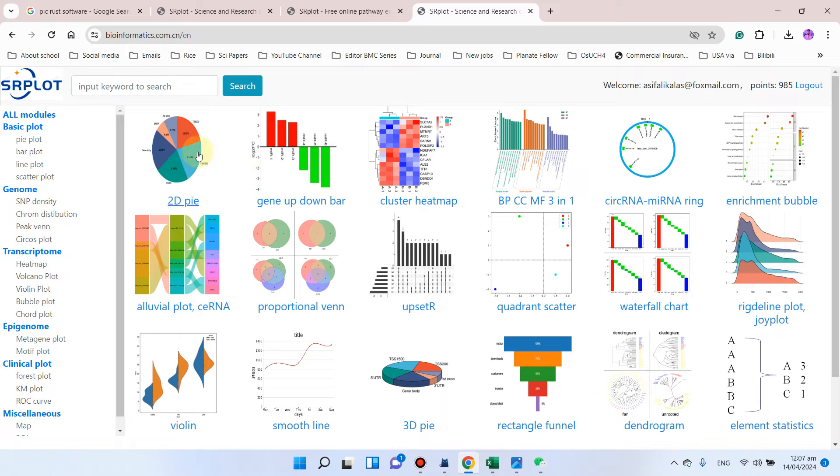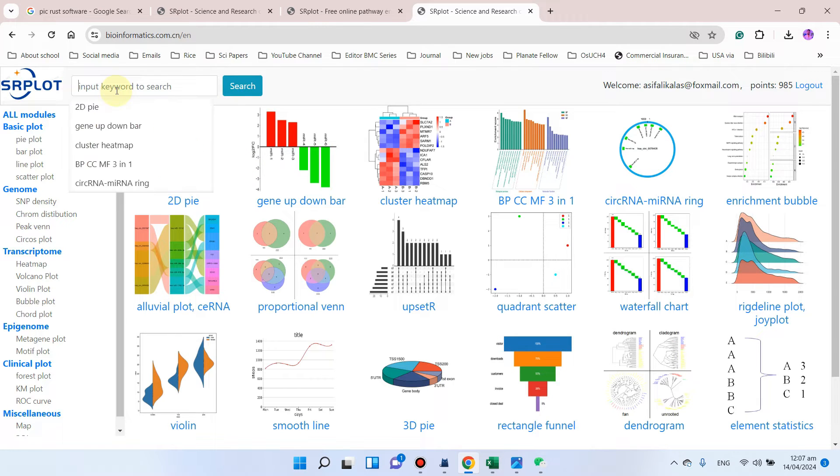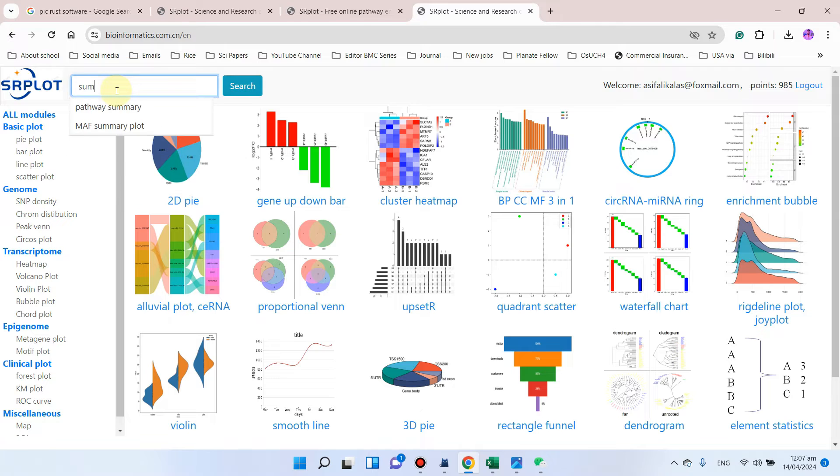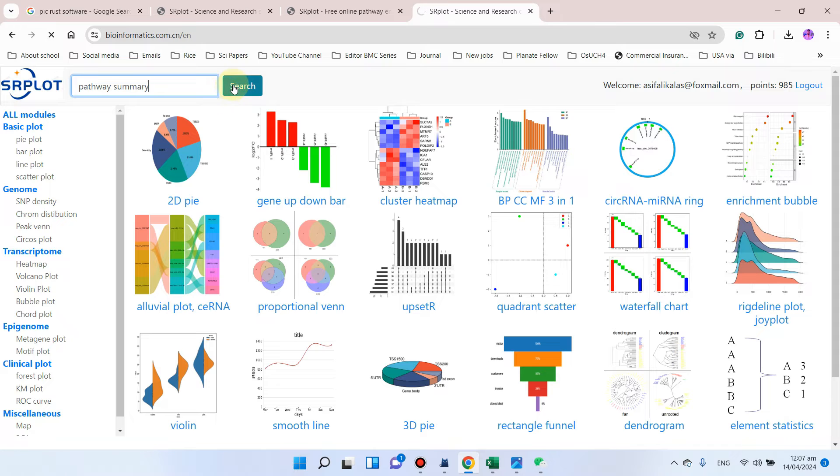After you login to this website, you can simply search here as summary or pathway summary. You can simply click on this and press search.